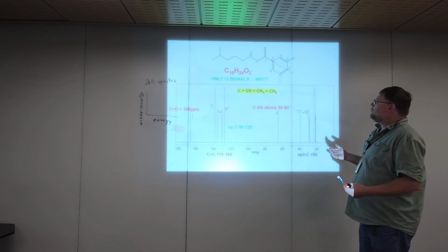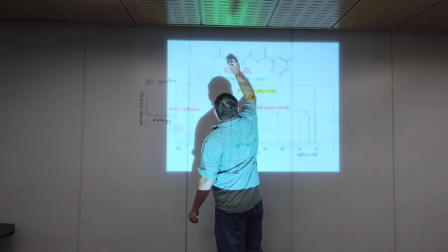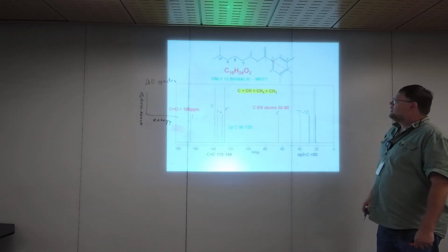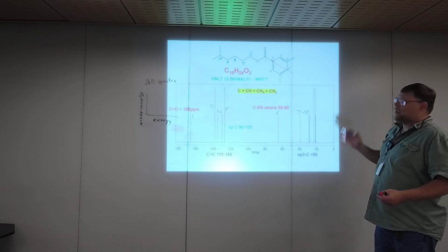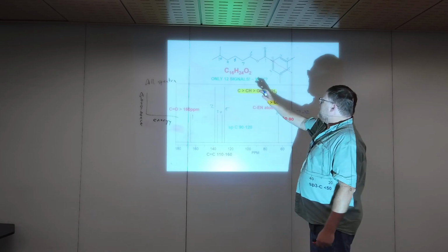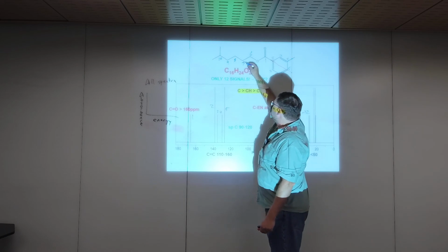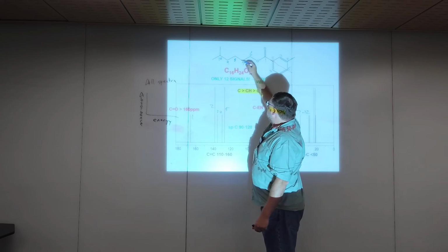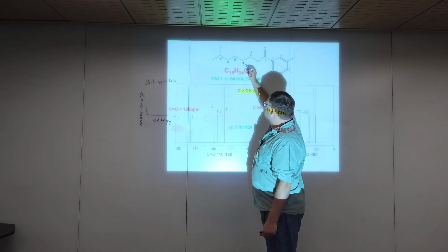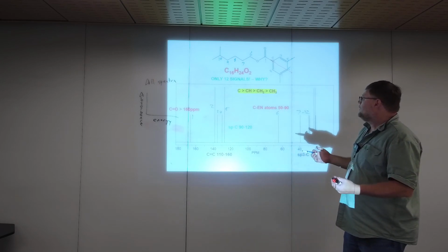And then we need 7 through 12. So let's just do this. 7, 8, 9, 10. You can't find a difference there. And again, I'm just counting right now. I'm not assigning signals. 7, 8, 9, and 10. There's no plane of symmetry that gives you another molecule, right? This is a CH2 bonded to a CH2O. That's a CH2 bonded to a CH2, CH2, but no O's as close. So 7, 8, 9, and 10 are all different. The CH is obviously different than any CH2.